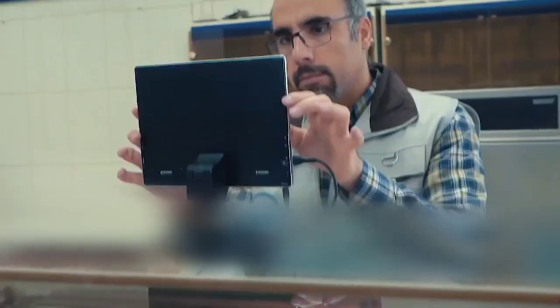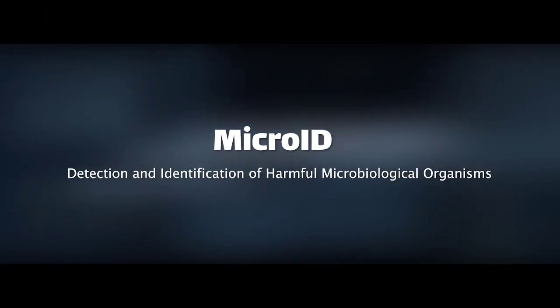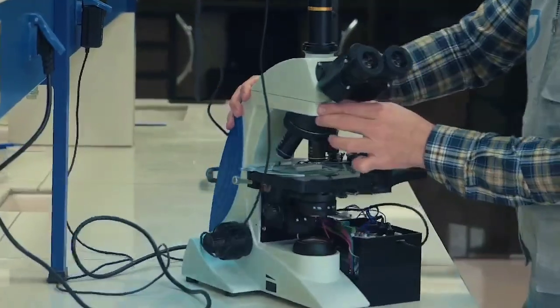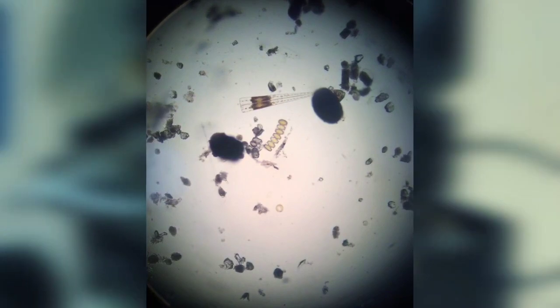Microbiological organism concentrations, including zooplankton and phytoplankton, are crucial indicators for assessing water resources and drinking water quality. The presence and concentration of these organisms can directly and indirectly impact water health. The conventional method for biological assessment is classic microscopy. However, this technique is time-consuming and prone to errors.